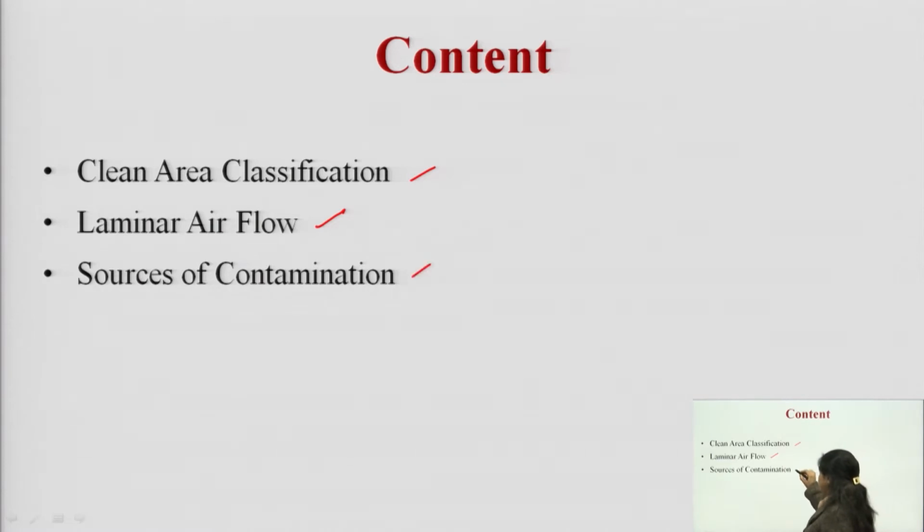We will also focus on some of the sources responsible for microbial contamination within the area, and on the preventive precautions we can take so that we can avoid the sources of contamination within the area.